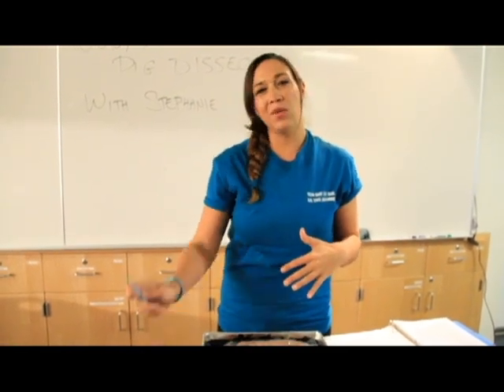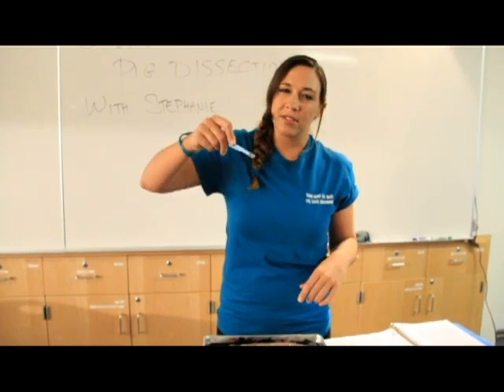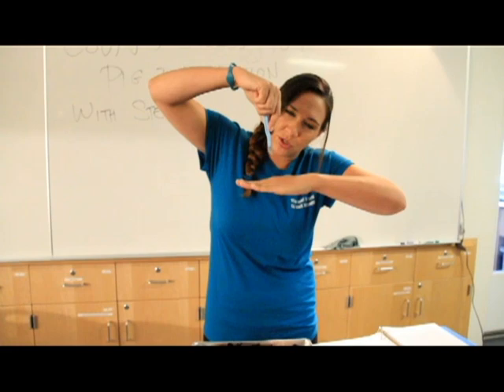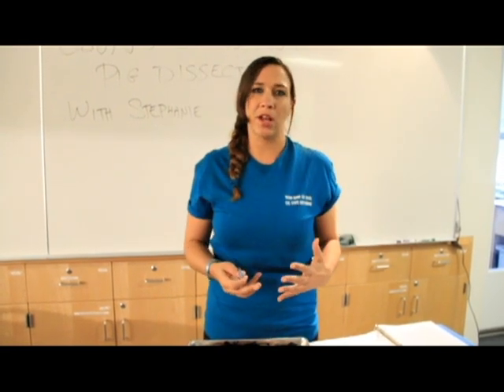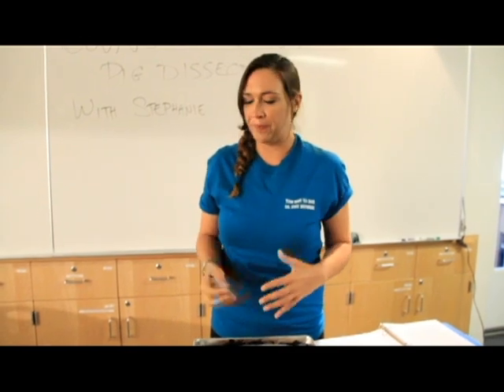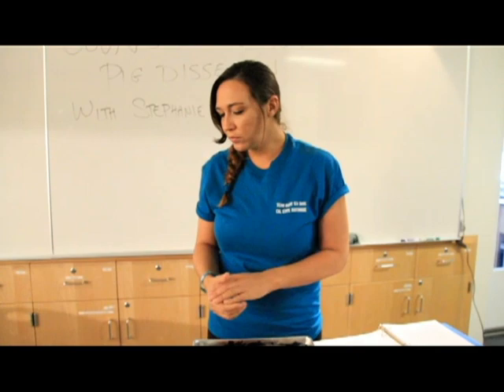You never really want to use your scalpel unless you're getting into the mouth and you have to break some jaw bones. The scalpel you can't control, and if you were to pierce, you have to push so hard down on it that you really can't stop where you're going, and then you start cutting up a lot of really valuable small arteries and veins, and we don't want to do that.